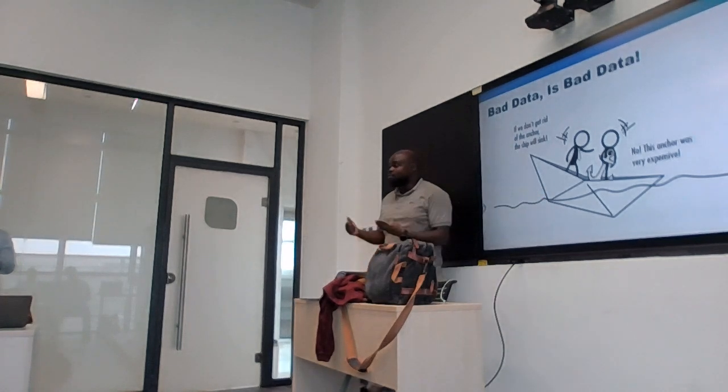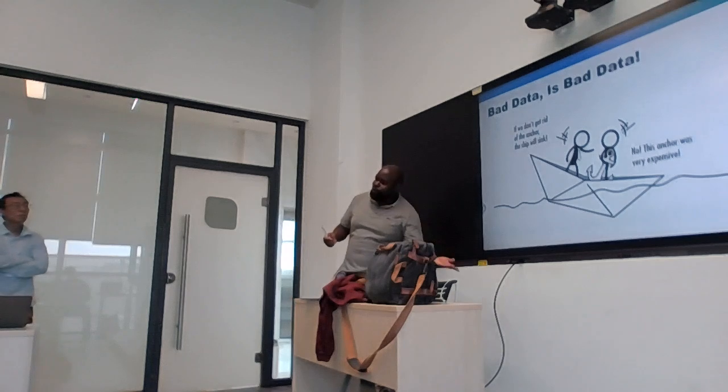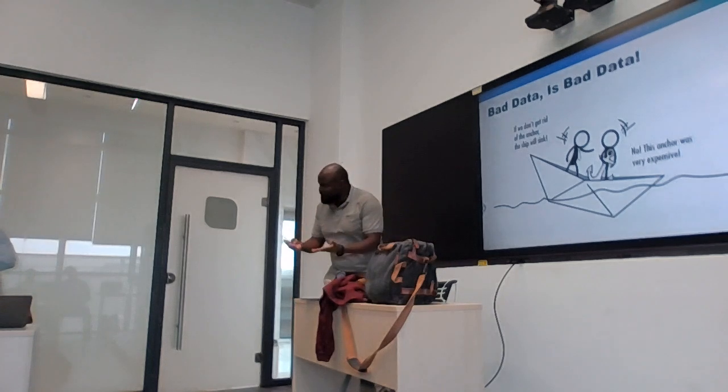So it's the same thing we often think, like, oh, but I've sequenced this sample, it's expensive, I cannot throw out the reads, this is precious. But you see, bad data is bad data. It's going to lead you to wrong conclusions. So if it is bad, it is bad. There is nothing you can do.